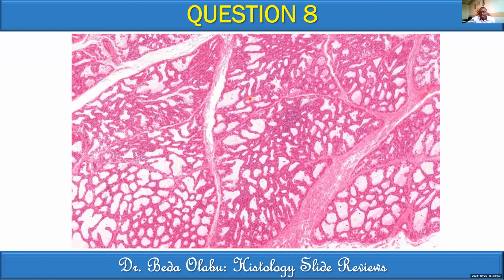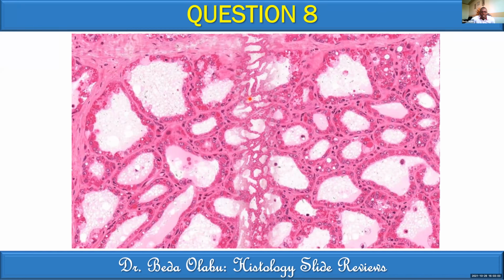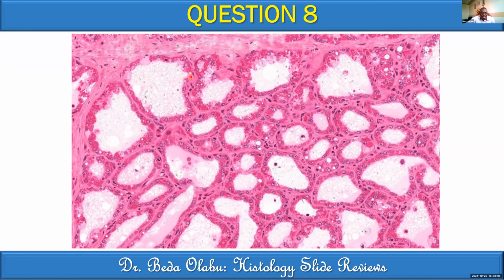I'll talk about it. So this one is showing us a gland, but at a high magnification, we see that the glandular units are largely made up of simple cuboidal epithelium. This is actually histology of the breast. Maybe you'll talk about glandular epithelium and breast histology another day. But this just captures for you simple cuboidal epithelium that form glands.